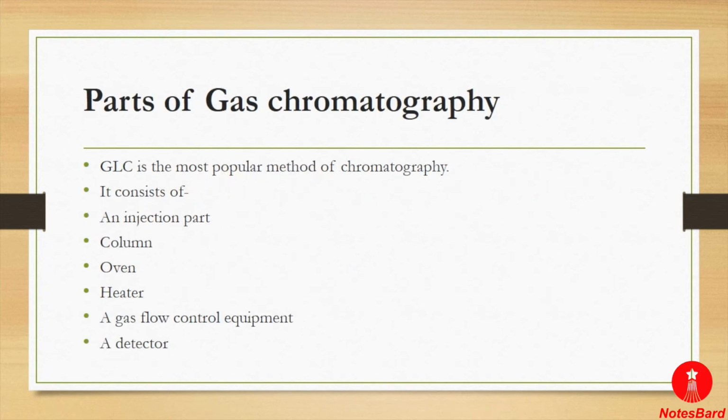So now, before moving to the procedure of the working mechanism of gas chromatography, let's understand the instruments and the equipment used for this method. Among both of the types, the GLC, or gas liquid chromatography, is the most popular and widely used method for chromatography.